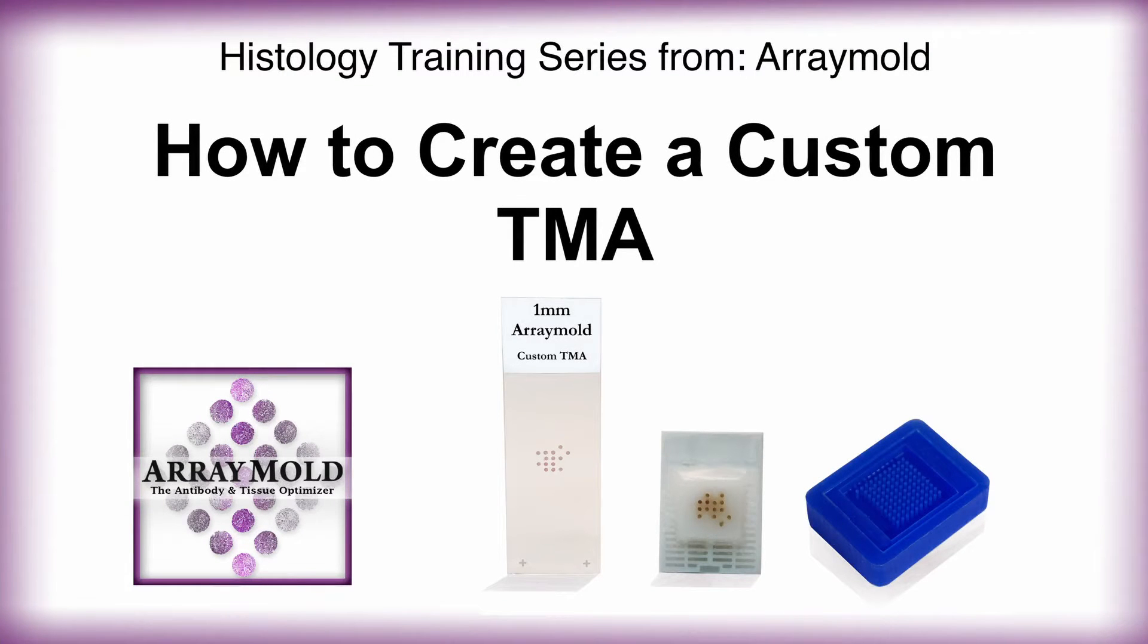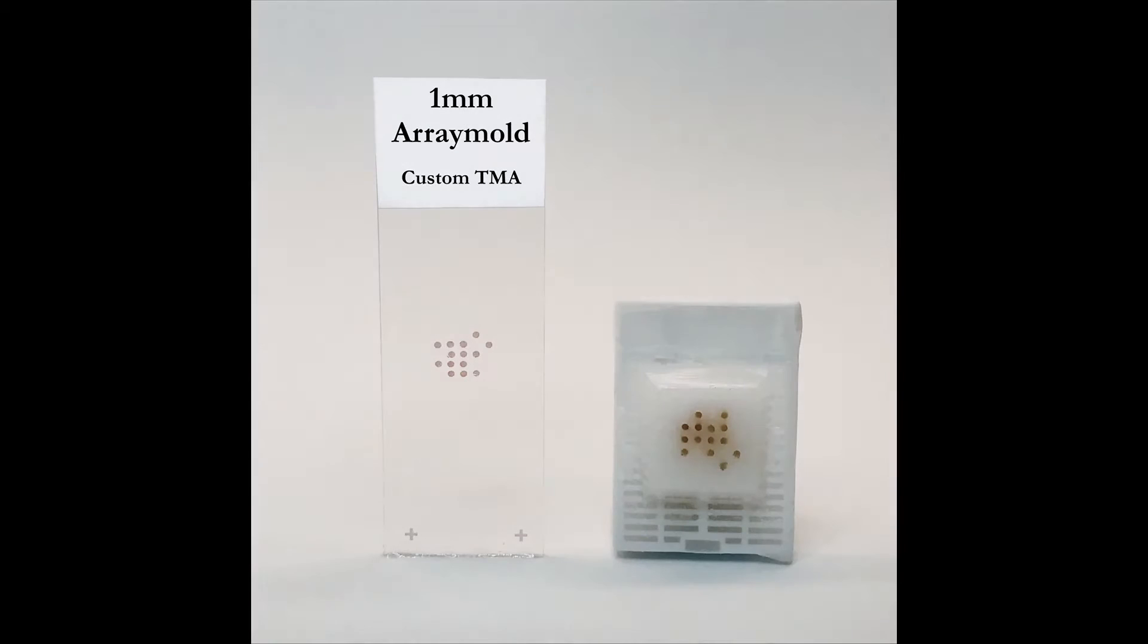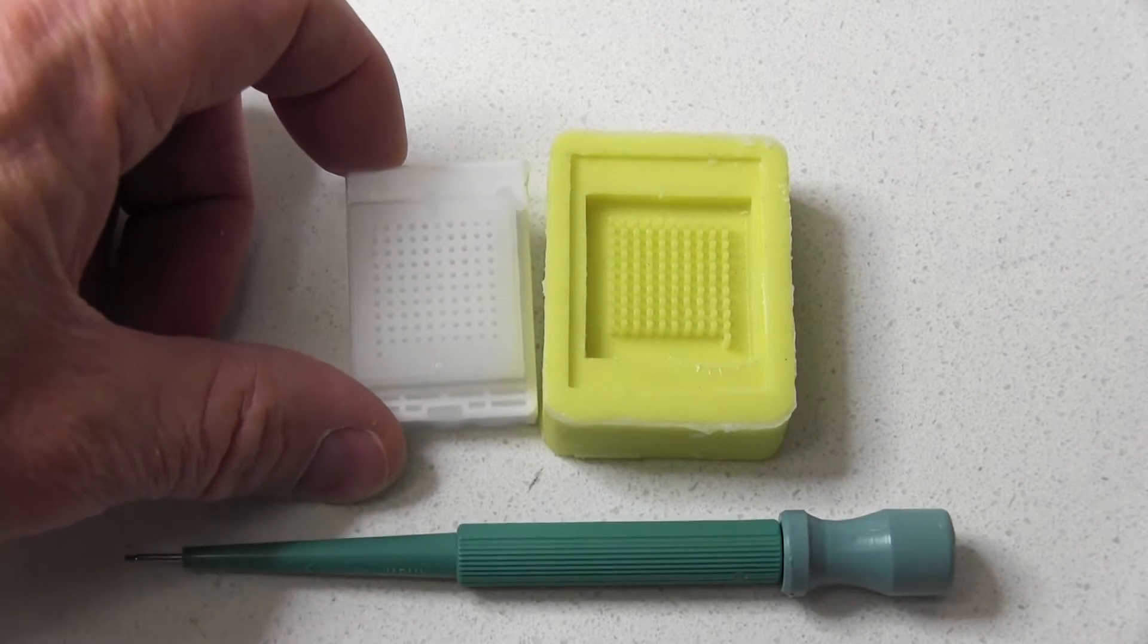Welcome to another training video from ArrayMold. Today we're going to explain how to create custom TMAs using the 1 millimeter ArrayMold.